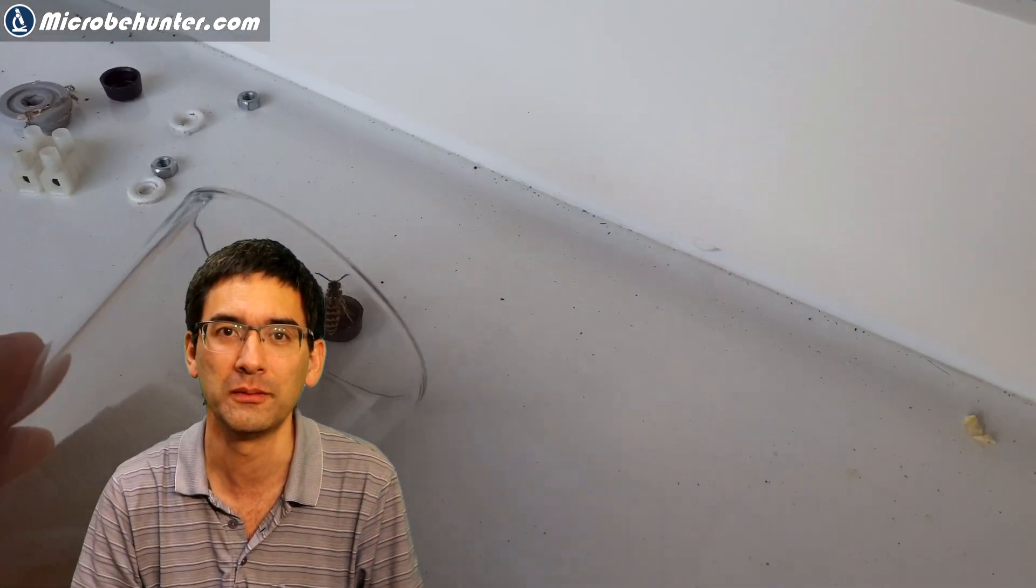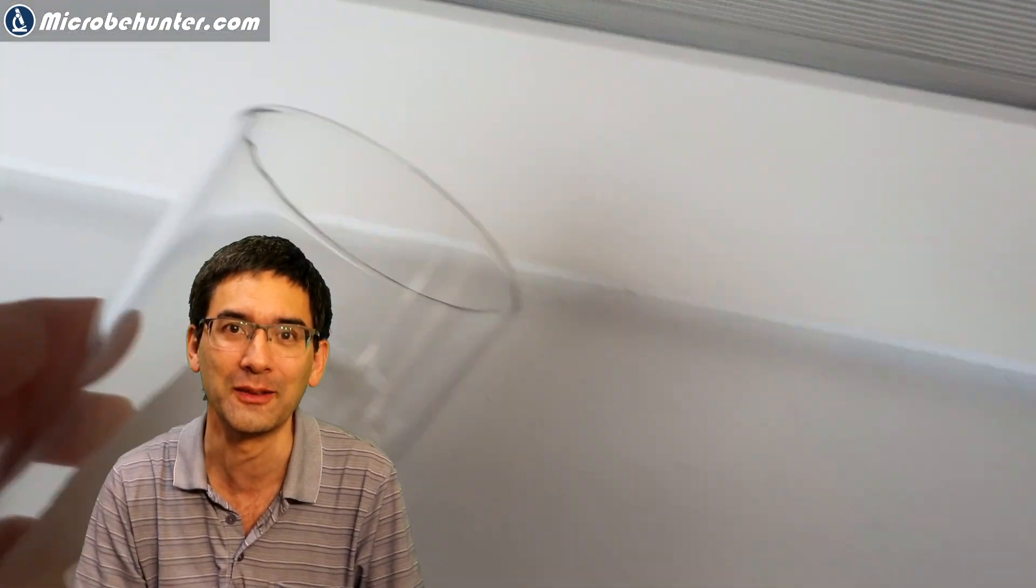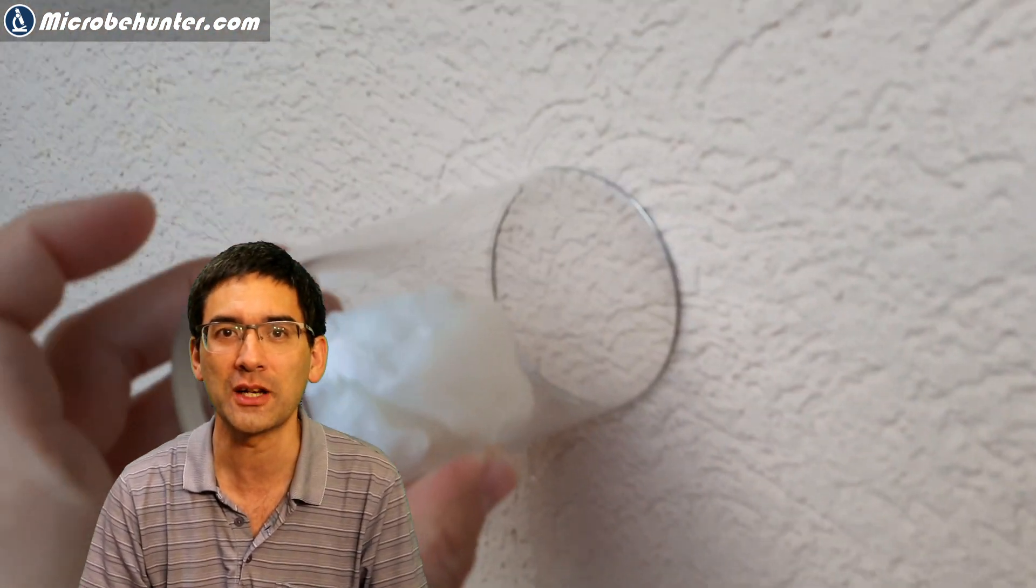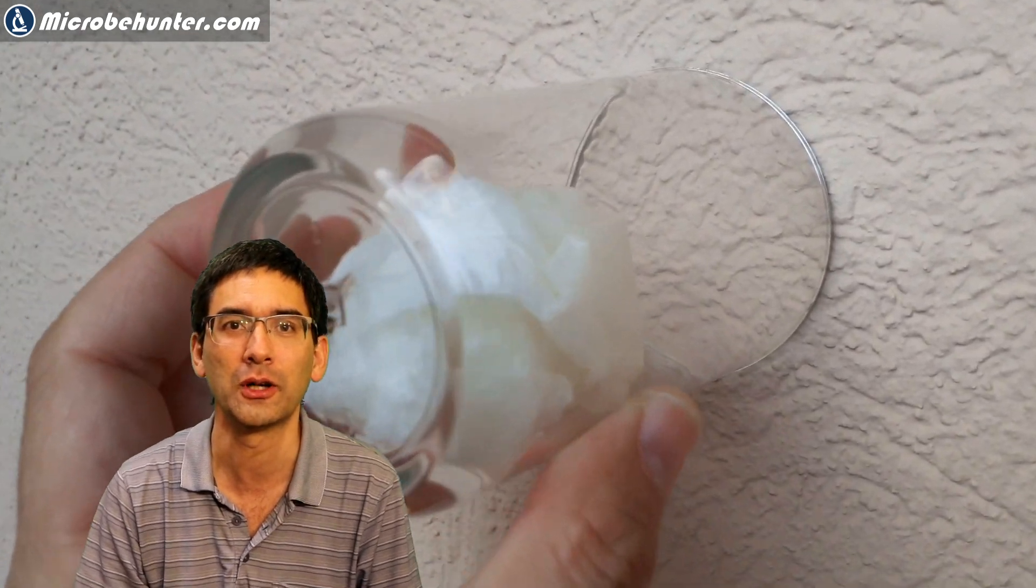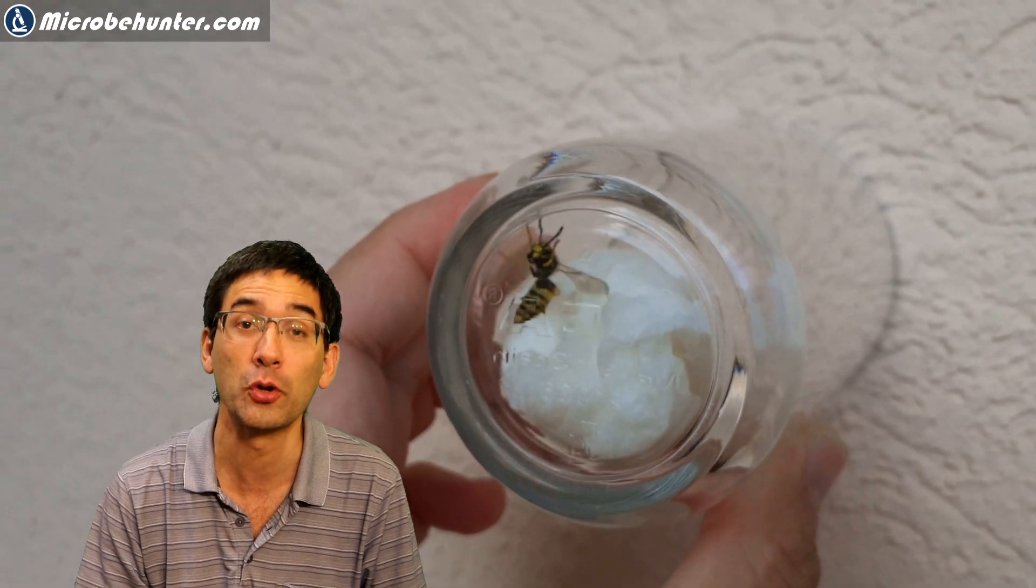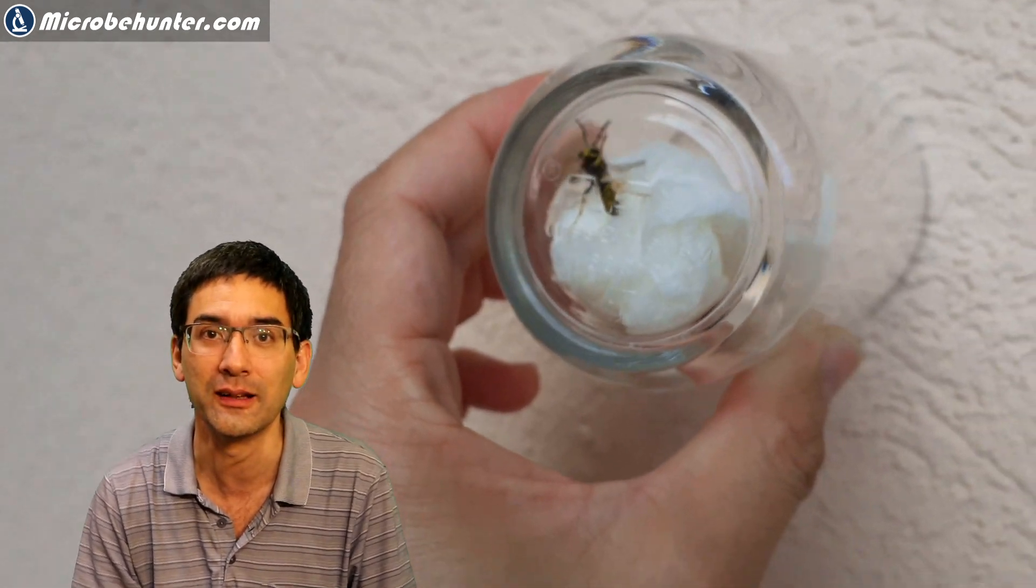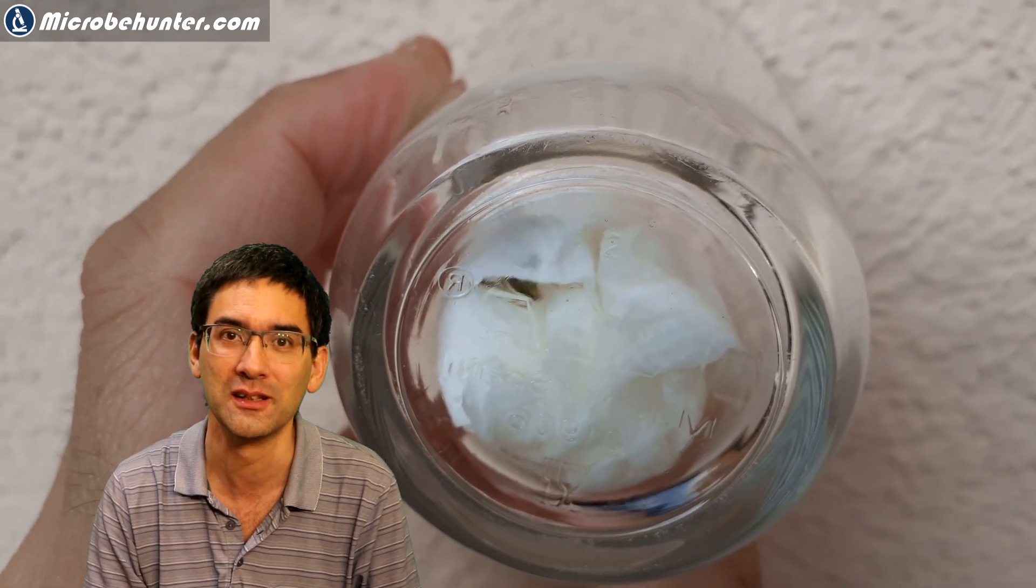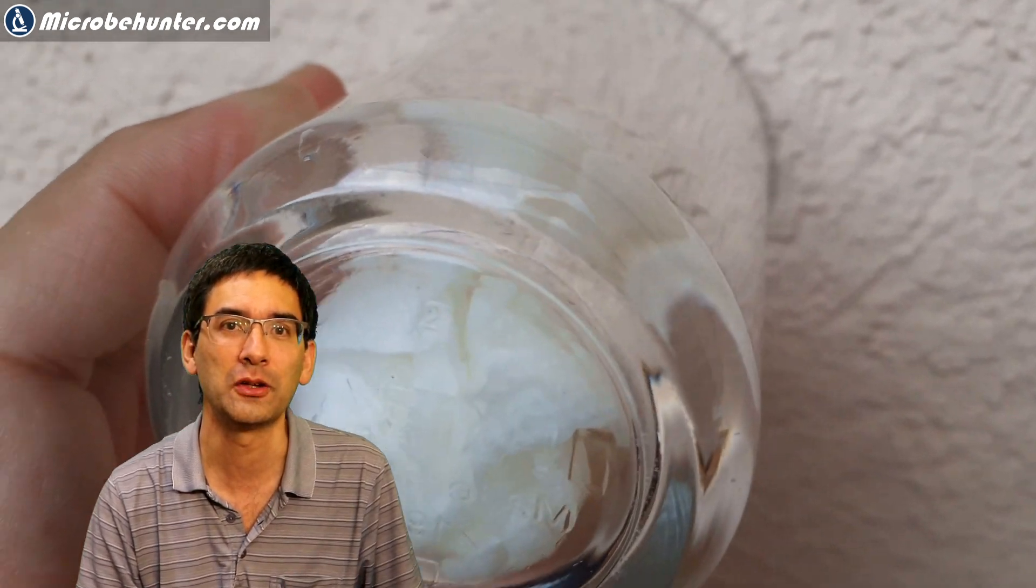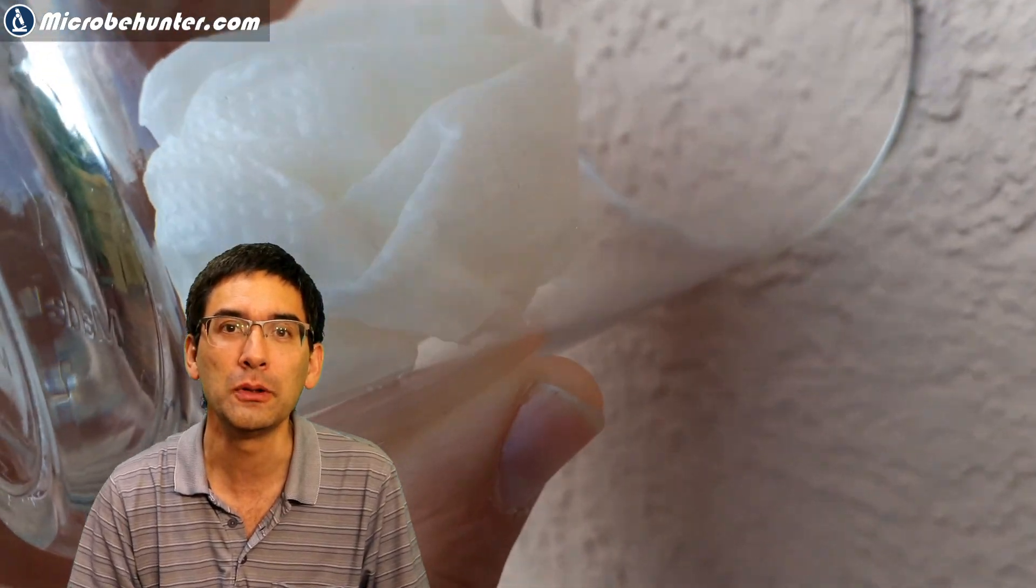And of course, the fumes kind of killed the wasp. And therefore, I could easily put it under my stereo microscope. Catching them was actually not so difficult. And after a couple of minutes, I could actually then put it under my stereo microscope. And then I also decided to dissect it a little bit and to extract the stinger. Here you can still see the wasp moving around a little bit. And after a couple of minutes, I could easily manipulate it.